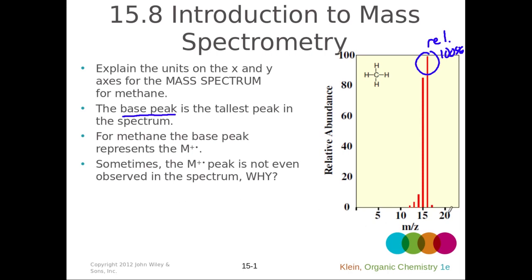Well, the spectrum that we have here is rounded to whole numbers, and so we just say that 1 proton is 1 AMU, 1 neutron is 1 AMU, and so just using whole numbers for those, we can say that carbon-12 weighs 12 AMUs, and each of these hydrogens is 1 AMU each. So that means that this molecule of methane weighs 12, 13, 14, 15, 16 AMUs.